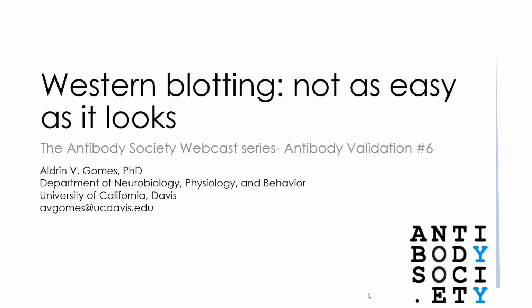I think this is an excellent example that shows that even very common validation technologies can be more challenging than they appear at first sight. One important thing to remember is that in the data sheets, the suppliers will describe a specific Western blot protocol under which the antibody you have bought may have been validated. That may well not be the same protocol you routinely use. For example, it is often not clear if the blotter has used nitrocellulose or PVDF paper. Use the wrong one, and the antibody may well not work. Nitrocellulose is hydrophilic while PVDF is hydrophobic, so the proteins absorb in entirely different orientations and are differently denatured and presented on the paper surfaces.